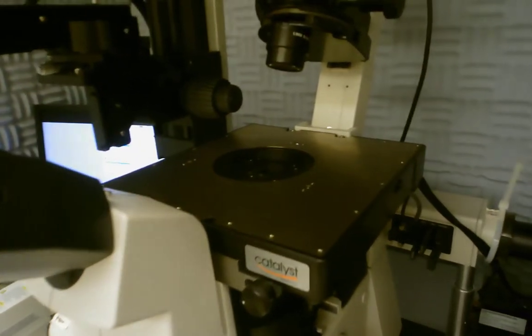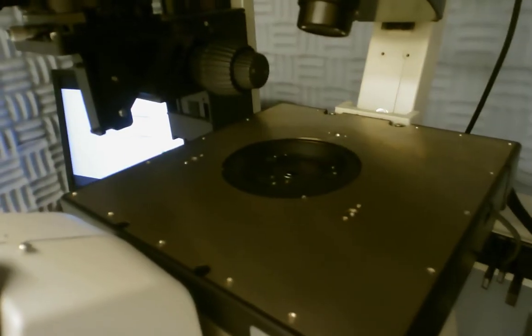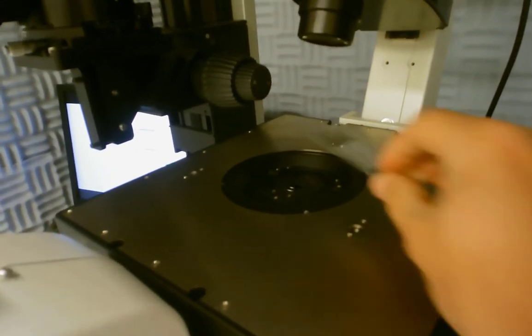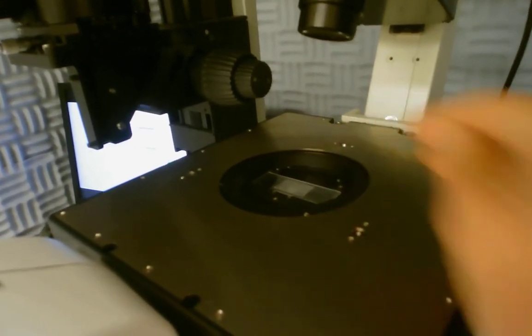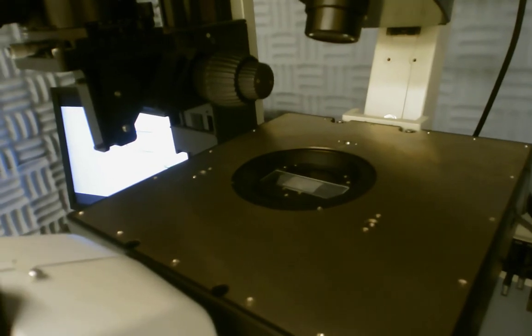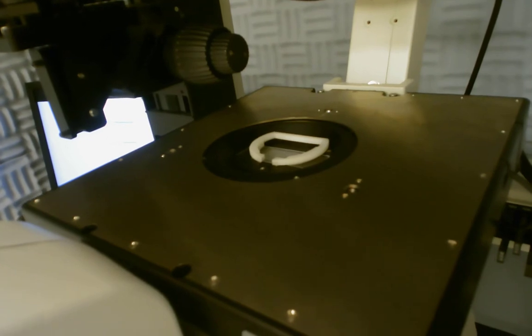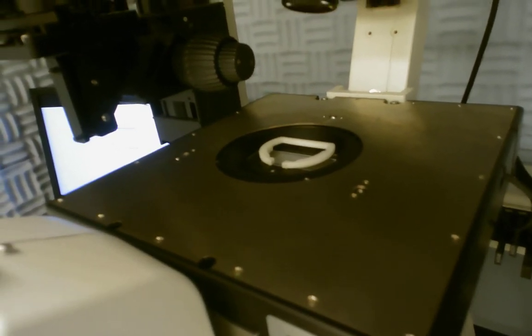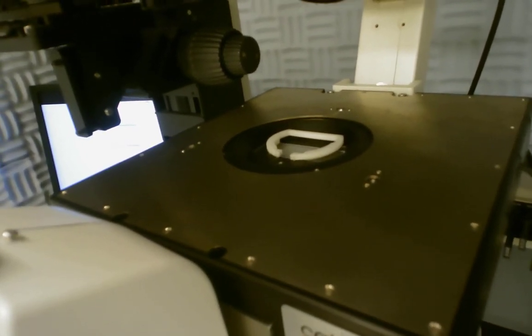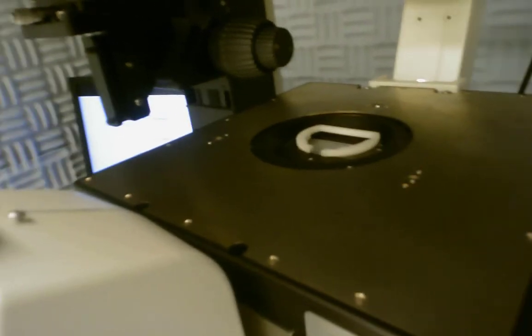The sample is mounted up here on this mounting plate. I have a blank glass slide with just a piece of tape on it as a display. And then the sample is clamped down with this magnetic holder. There are a couple different holders that can be used depending on the shape of the slide or what have you.